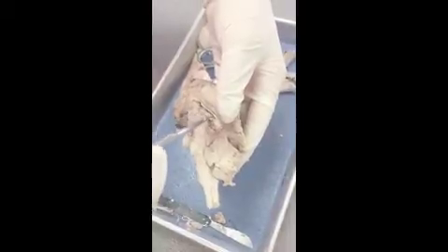Right here is the lateral ventricle, which cushions the brain and helps circulate nutrients and remove waste. Right here is the third ventricle, which sends and receives messages from the lateral ventricles. And here is the fourth ventricle, which protects the brain from trauma.